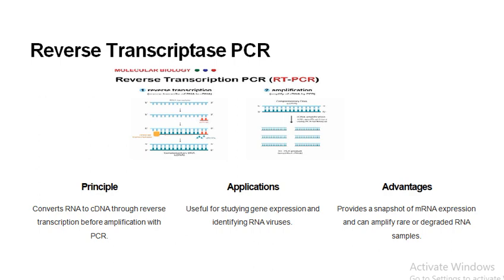The viruses. Whatever we extract from the viruses that have RNA as genetic material, we use as a single strand, and we produce a complementary DNA with the reverse transcriptase enzyme.